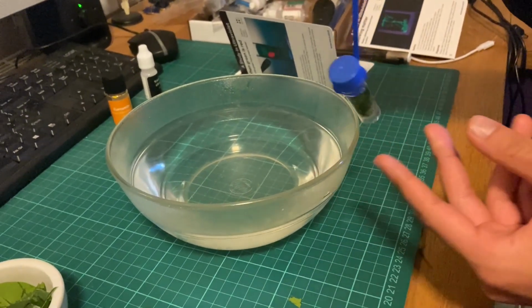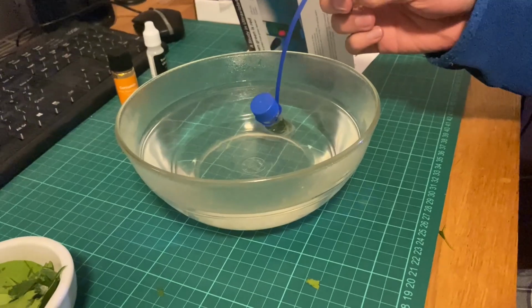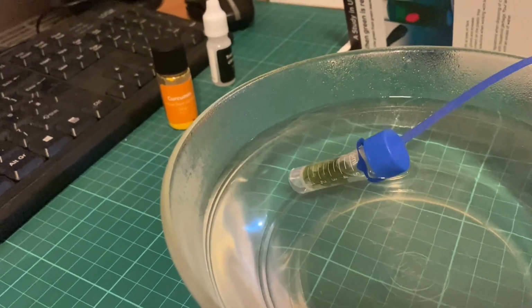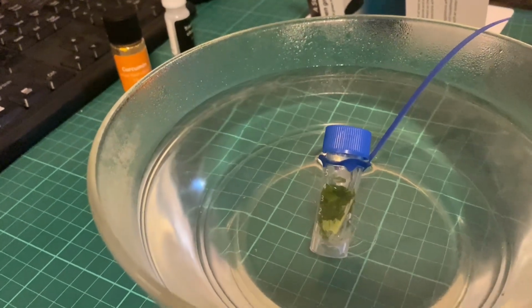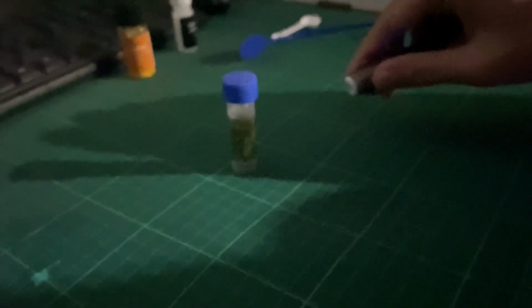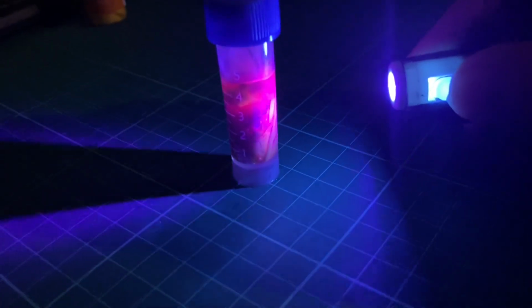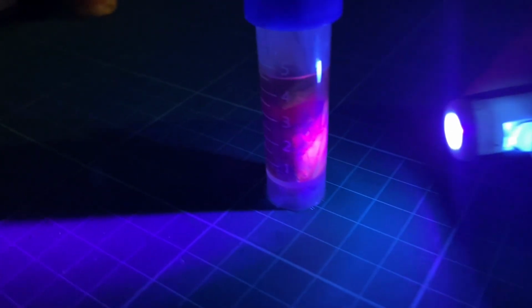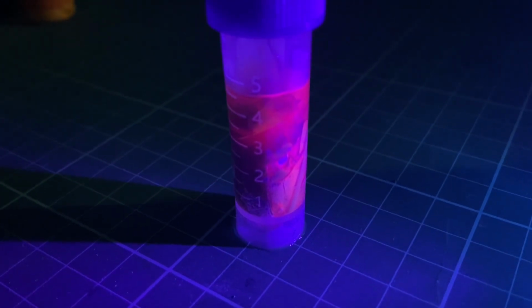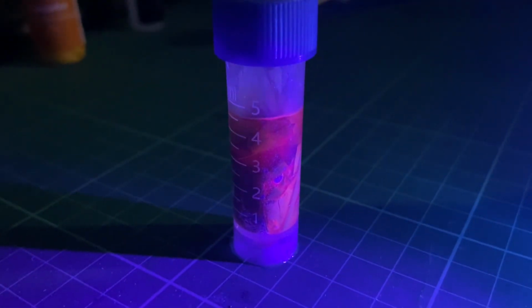This interaction is slow, however, so we need to use a hot water bath to speed it up by increasing the temperature for 10 minutes. After taking the vial out and shining UV light on it, you can see that there is now a red glow. This is a result of UV light exciting electrons in chlorophyll, which, just like eosin, releases energy in the form of visible light when it goes back to its ground state.